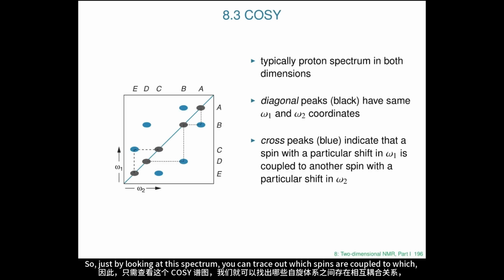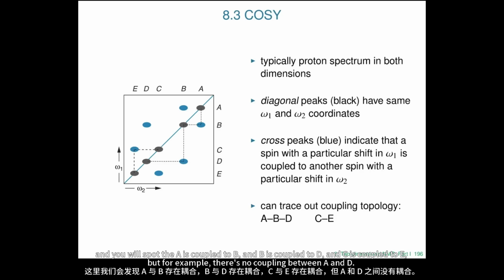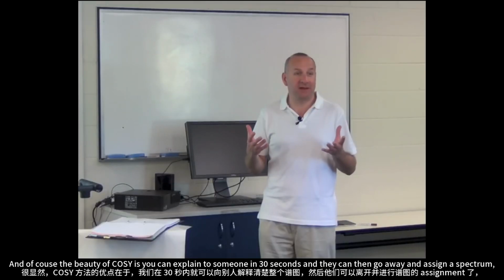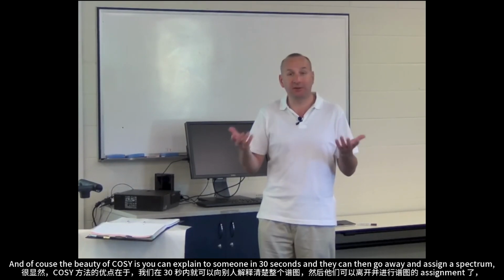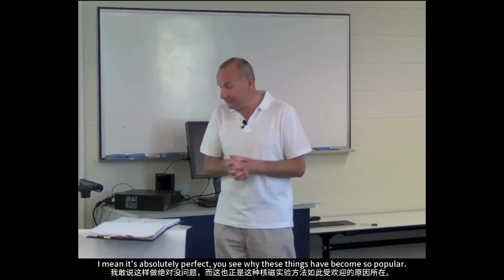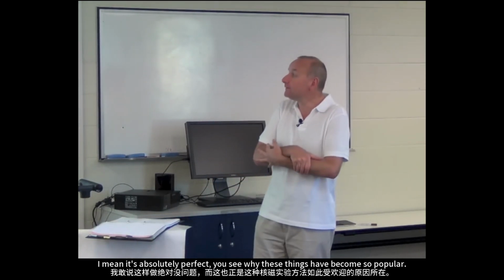So just by looking at this spectrum, you can trace out which spins are coupled to which. And you will spot that A is coupled to B, and B is coupled to D, and C is coupled to E. But for example, there's no coupling between A and D. And of course the beauty of COSY is you can explain that to someone in 30 seconds, and they can then go away and assign a spectrum. I mean, that's absolutely perfect. You can see why these things have become so popular.